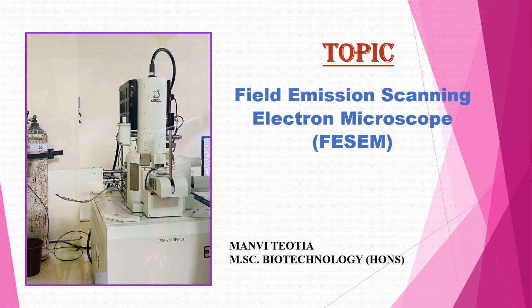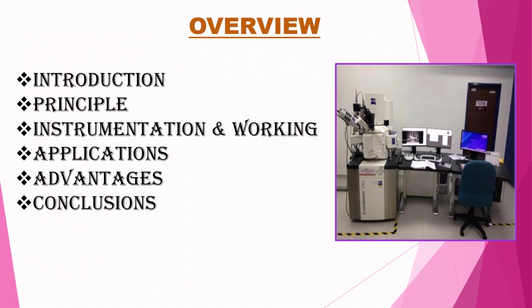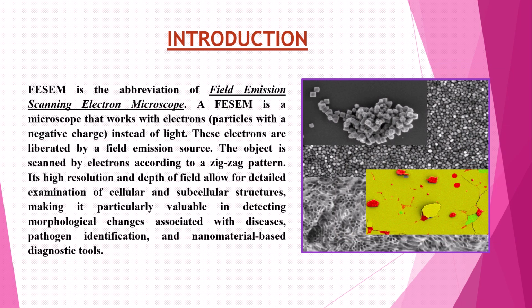Today we are discussing the topic Field Emission Scanning Electron Microscope, which is also known as FESEM. So here is an overview. We are discussing its introduction, principle, instrumentation and working, application, advantages, and its conclusion. So here is an introduction of FESEM.